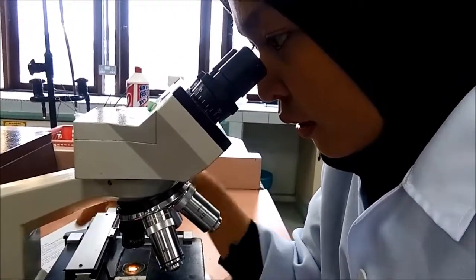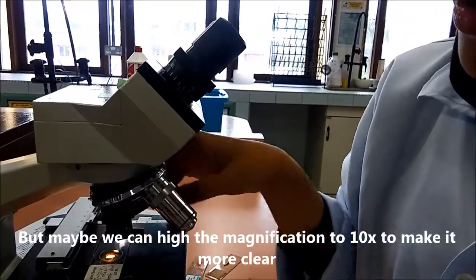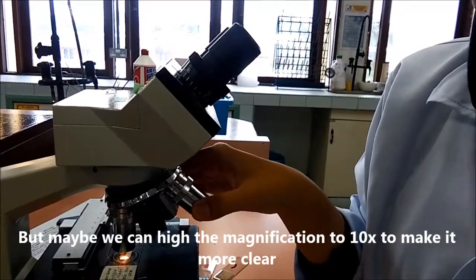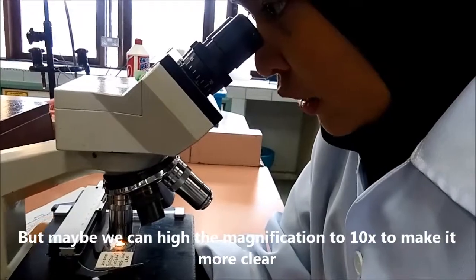And then I can see it clearly, but maybe we can increase the magnification to 10 times to make it more clear.